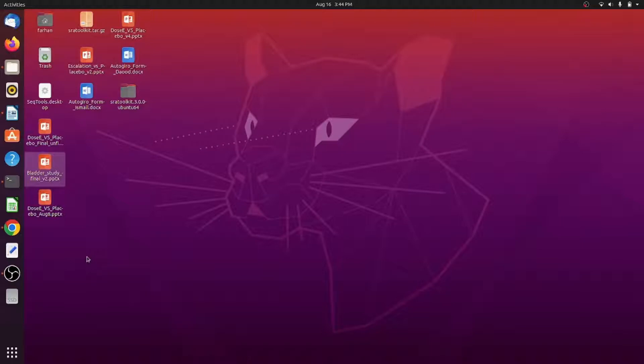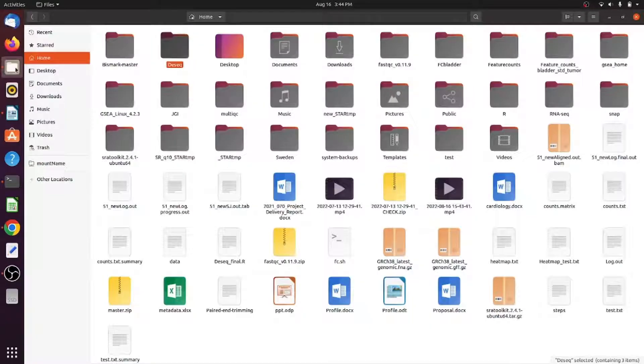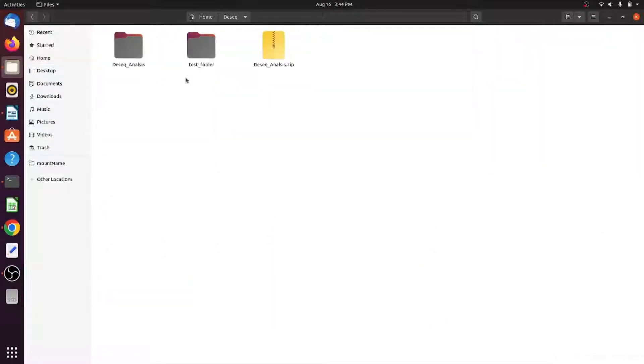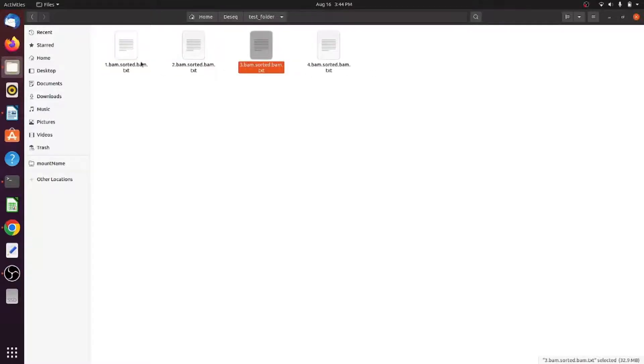That file is a bit challenging because there are separate feature count files for each of the samples. It is very easy to make using Linux commands. I'll show you how.